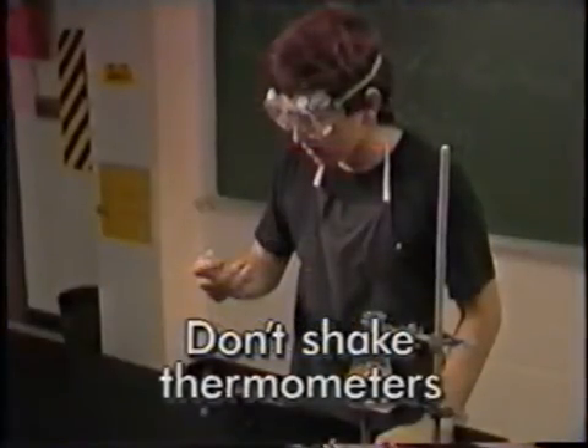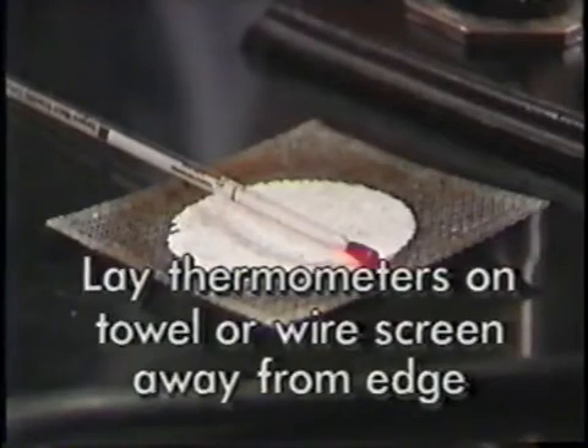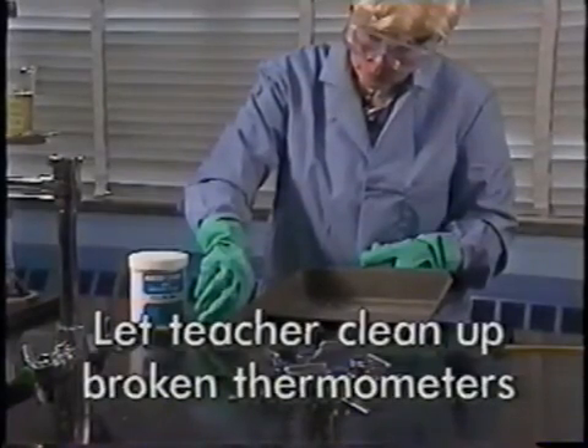To summarize thermometer safety: don't shake thermometers. Use thermometers only in the temperature range they're suited for. Lay thermometers down on a towel or wire screen to cool, away from the edge of the bench. Let your teacher clean up broken thermometers.